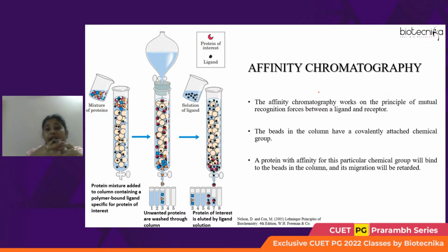Affinity means something related to attraction. Here, affinity means attraction. So, attraction of what? Attraction of a ligand with a receptor. Now, here you can see the two terms, ligand and receptor. So, what is a ligand? A ligand is any group, any molecule which can attach to a macromolecule.